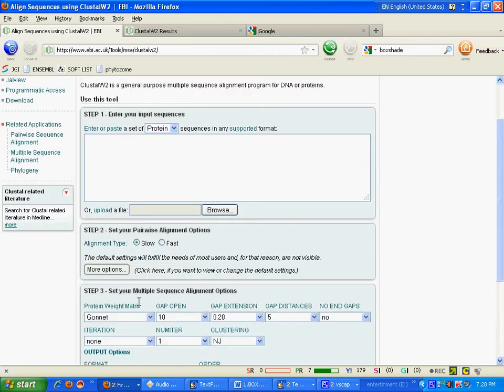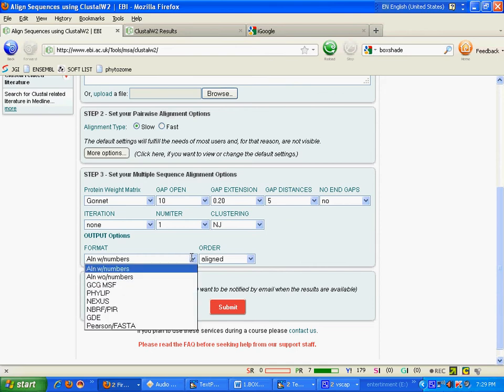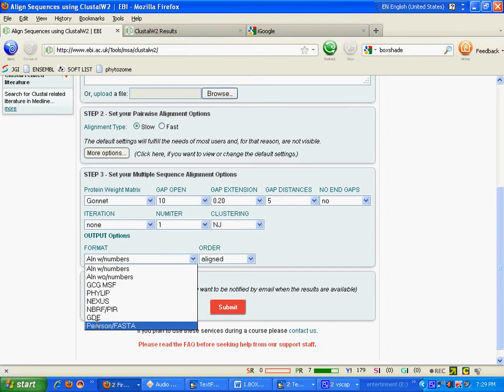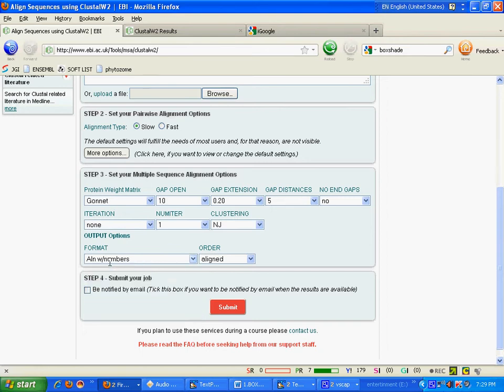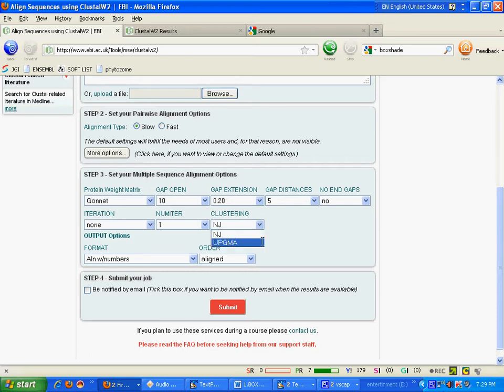You can choose some more options like what would be the format of your multiple sequence alignment. Here I will choose the ClustalW format. Here is the order you want your multiple sequence alignment in aligned format or input format. What would be your tree type.